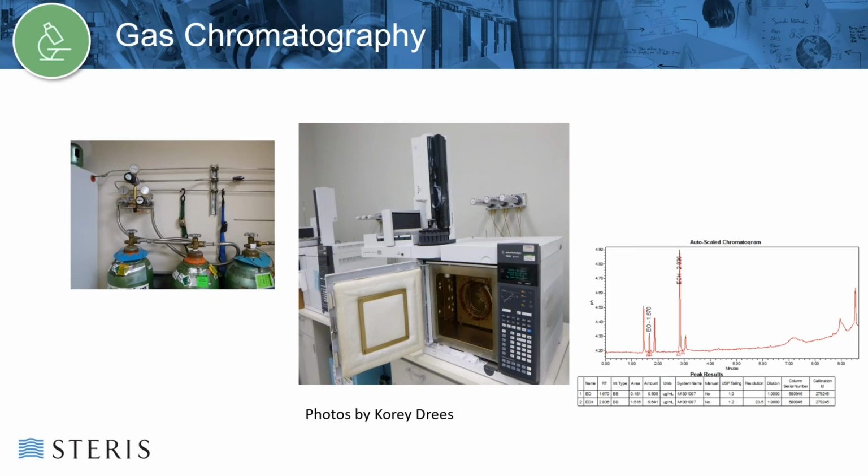Sample extracts are injected into the inlet, where they are volatilized at high temperature. The chemicals move through the column with the mobile phase gas, and are separated due to differences in their reactivity to the stationary phase that lines the interior of the column.